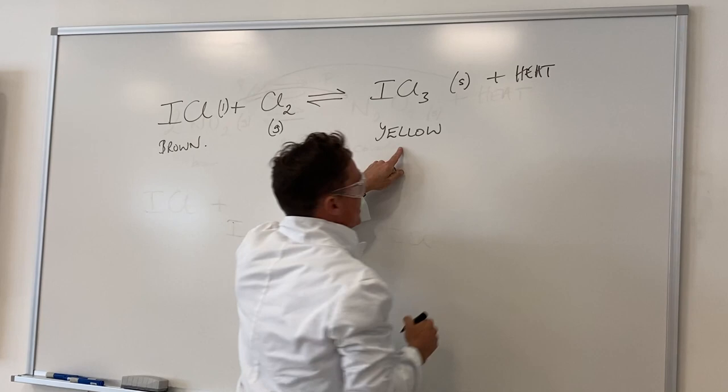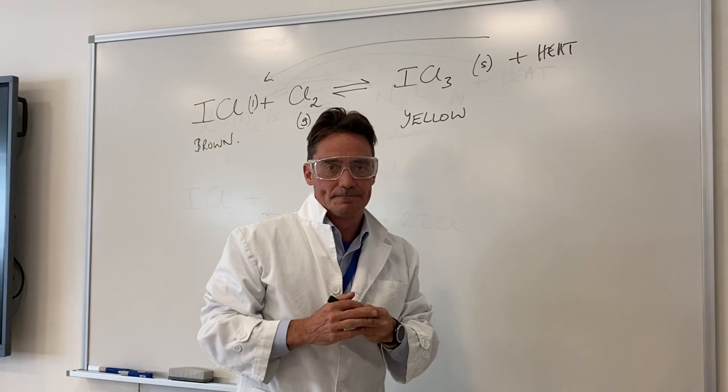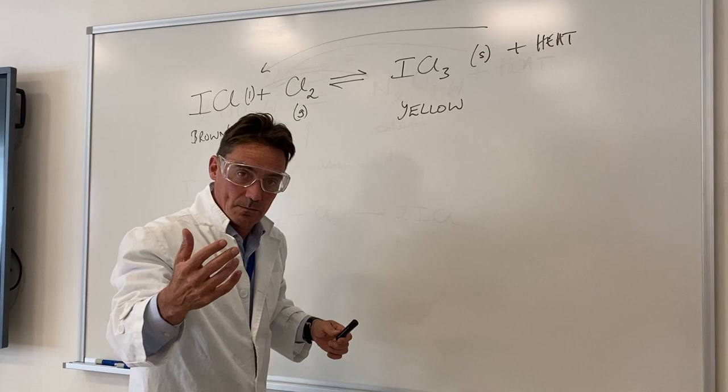If I add heat to the yellow stuff, it's gone brown, hasn't it? And I've moved the equilibrium over to the left hand side. So the forward reaction is exothermic, i.e. it gives off heat.